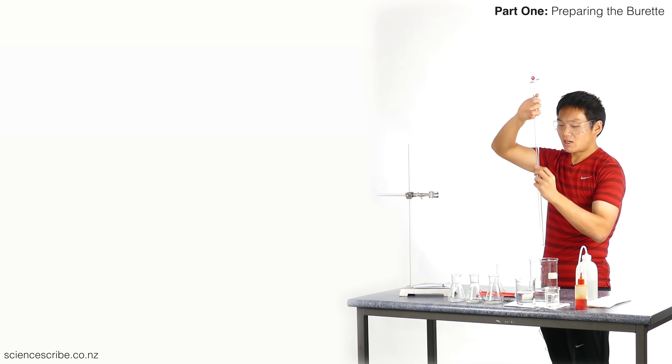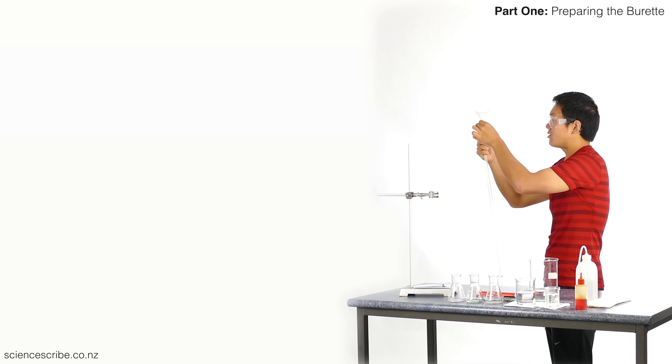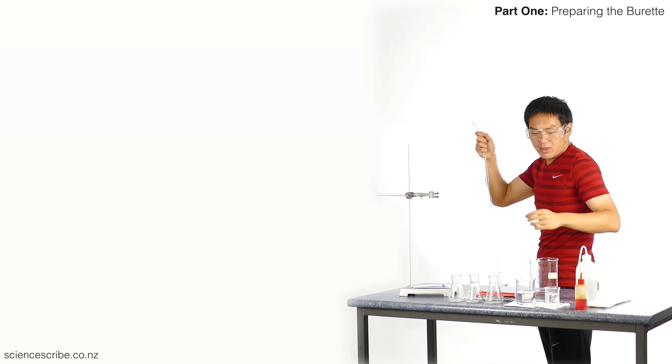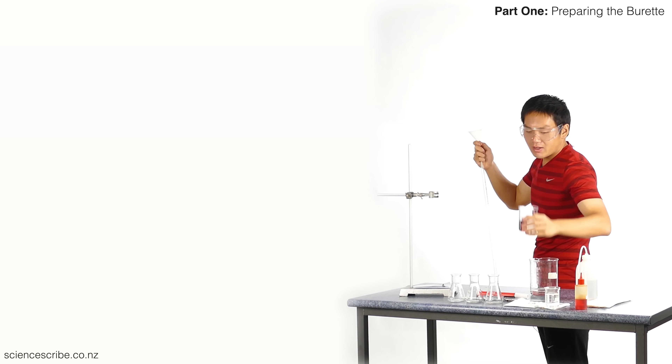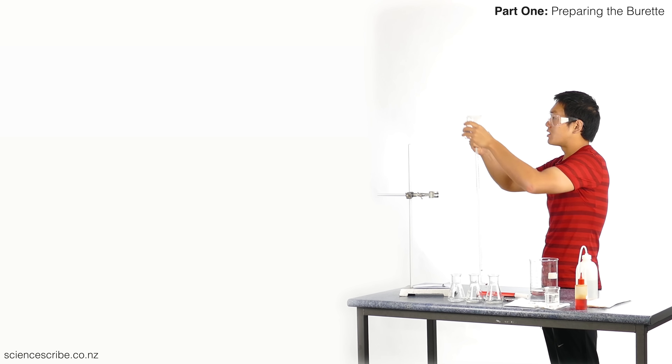I'm going to rinse this out a total of about three times, so two more to go. Remember: check that it's closed, burette in one hand with the funnel held up just a little bit. We're filling it with hydrochloric acid so we rinse with hydrochloric acid — don't need too much, so just tap and go.